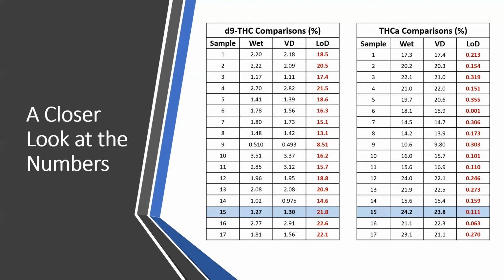This slide focuses strictly on the conversion of THCA to delta 9 THC. However, other acidified compounds such as CBDA and CBGA, which are prominent in some flower samples, will also undergo a similar conversion and weight loss when heated.